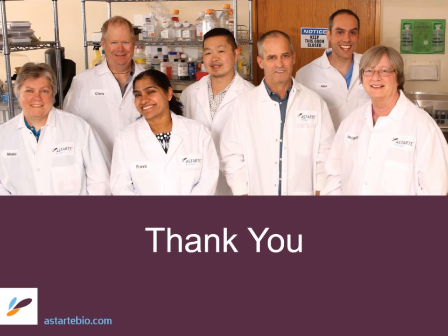But every once in a while we will run CD4 and CD8 just to see what the ratios are, because there are people who have different ratios of 4s and 8s. Totally. And it is interesting to dig in a little bit further and get those memory versus naive, central versus effector. If you have the colors available and you're clever enough to put them together right, you can have a really interesting panel.